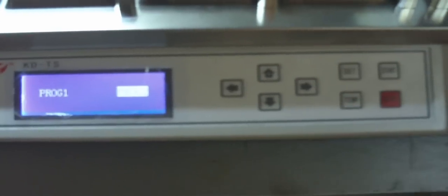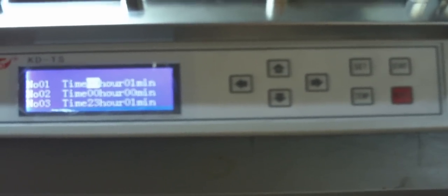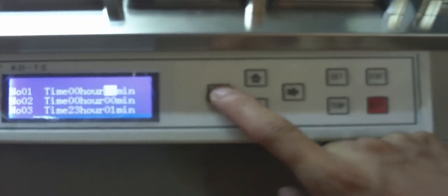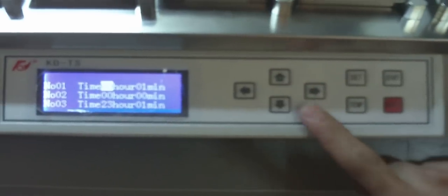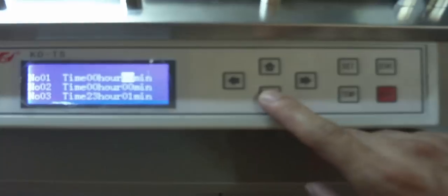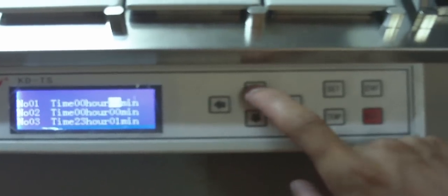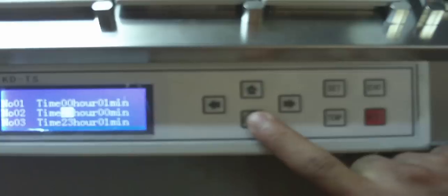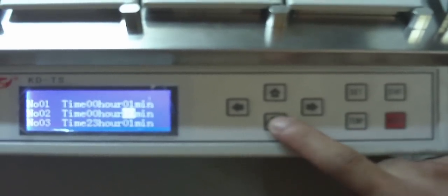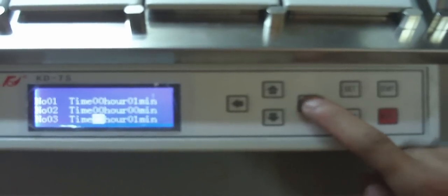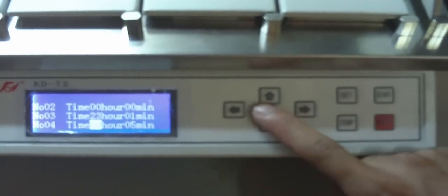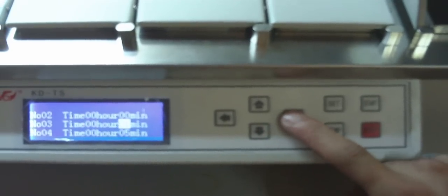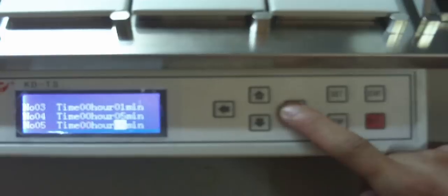Press the SET key to confirm the chosen program. Set the time for each step by pressing the up and down keys. Set the process time on the first step from 0 to 99 hours and 0 to 59 minutes. Set the other steps' process time from 0 to 23 hours and 0 to 59 minutes.